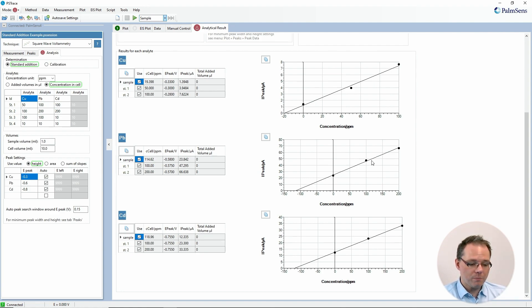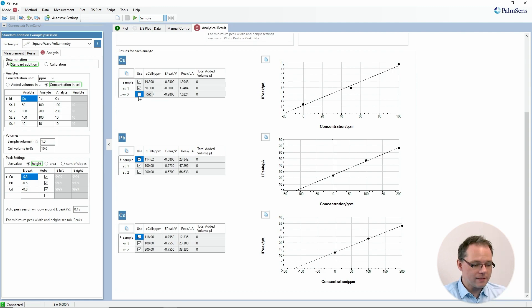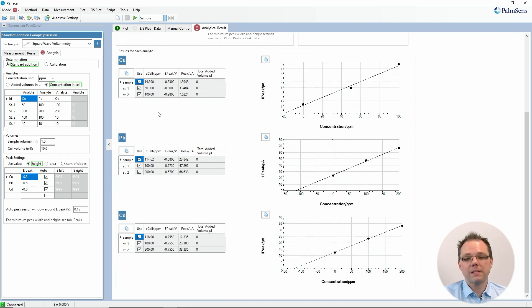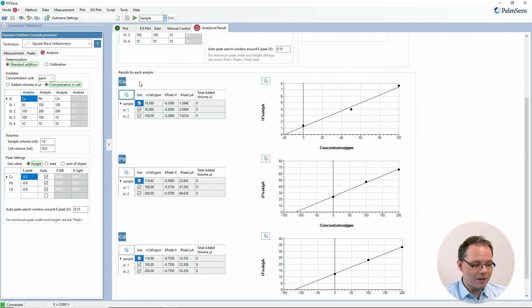Scrolling down, we now see for each analyte the curve that was made for the standard addition: where the different points are, first our sample point, then our two standard additions, and how the real concentration of the sample was extrapolated. You also see all these values, and by unchecking the boxes and then recalculating you can remove points from a measurement — for example if one of the standards looks really odd and you want to remove it.